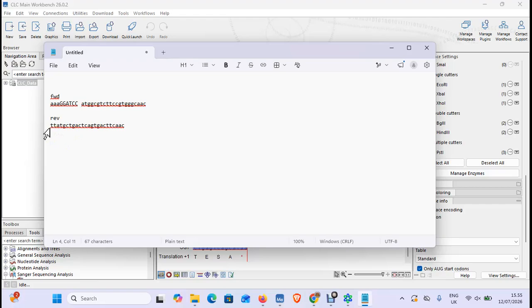And similarly for our reverse primer, since I'm a huge fan of NotI, once again, AAA to start with, then in this case, GC, GG, CC, GC, boop. And yeah, I know the space doesn't actually go into the primer, it's just for my own visibility. Point is, now you have your forward primer with a melting temperature of 68 or 66. For a good solid PCR reaction from a plasmid, this will be a slam dunk. That's the distinction. And reverse, same rules apply.